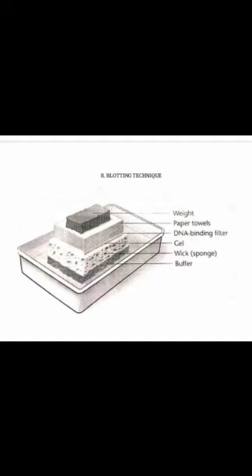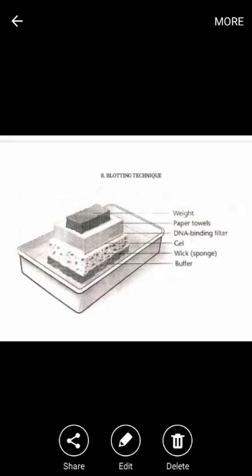After thorough washing, the paper is exposed to X-ray film, which produces specific bands corresponding to DNA fragments that recognize the sequence in the cDNA probe.